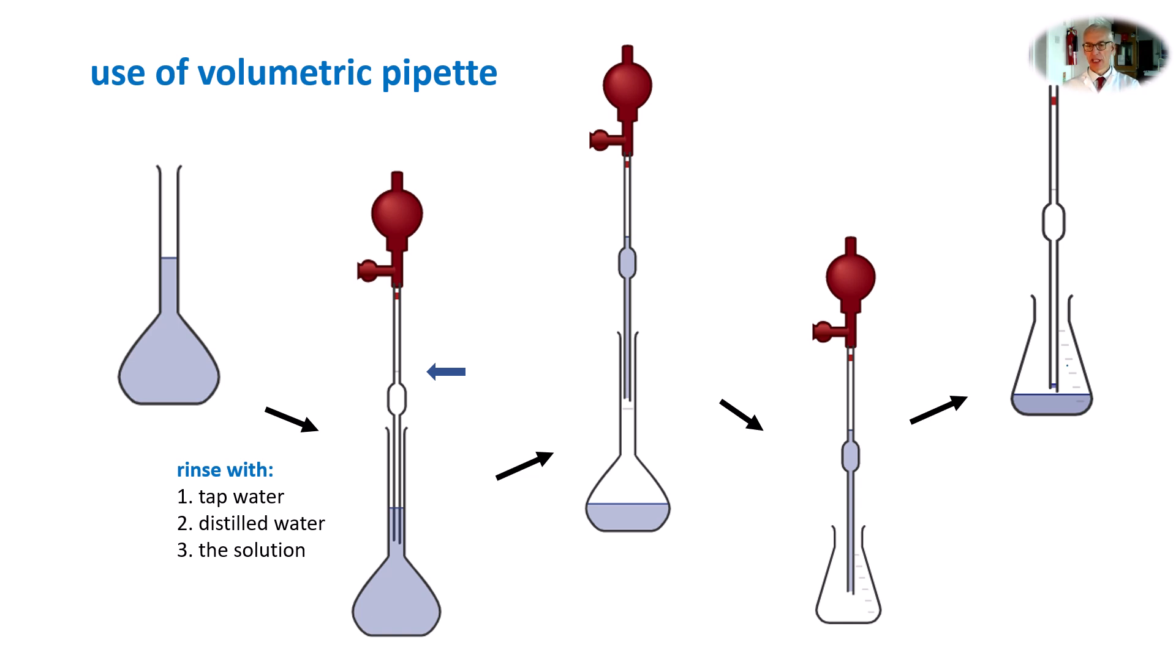Touch the surface of the solution with the pipette and allow the pipette to drain for 10 seconds after it appears to have been completed. You will then see that there is a small volume remaining in the pipette. That is meant to be there. That is part of the design. The pipette delivers 25 centimeters cubed from the graduation mark to the tip of the pipette, but the small amount of solution held in the pipette is taken into account in measuring that volume. Your pipette, when empty, should have a small amount of solution in the tip.